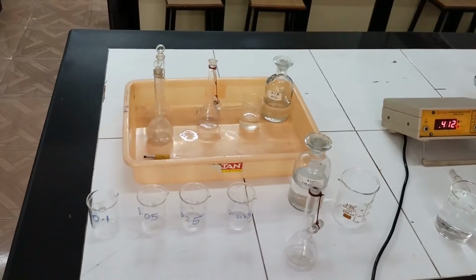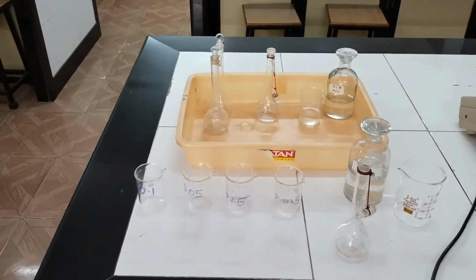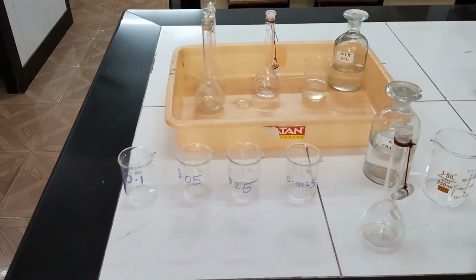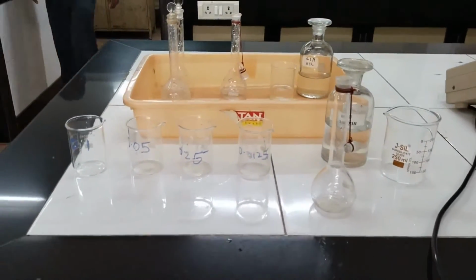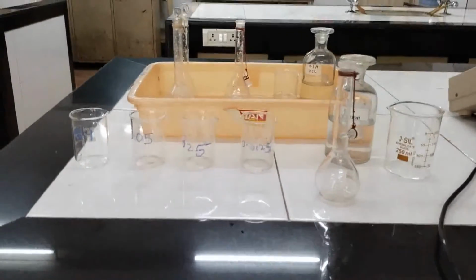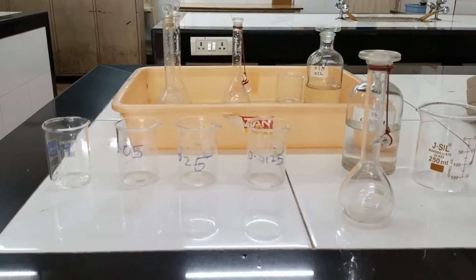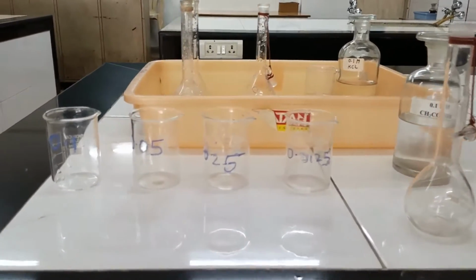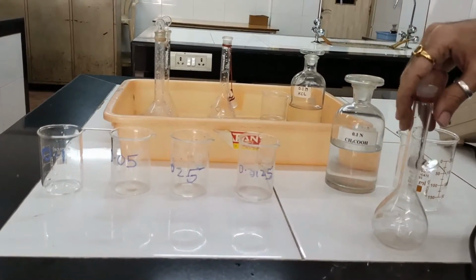Done. Now we go into step number 3. The first step was how to standardize the conductometer. Step number 2 was the determination of the cell constant by making use of 0.1 normal KCl. Now the third, one of the most important steps of this experiment, is the preparation of solutions. Yes my dear friends, if you prepare the solutions very well, then this experiment is absolutely simple. So please watch it completely.